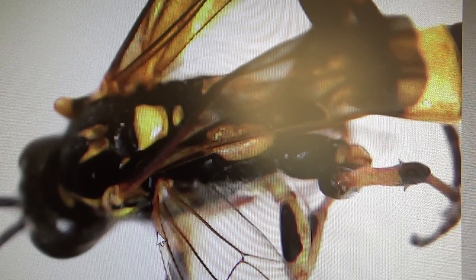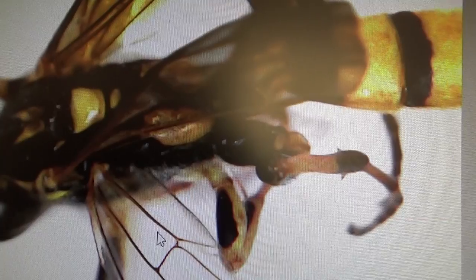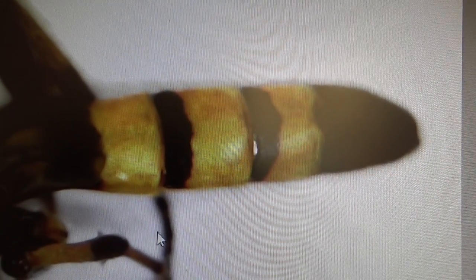Look how you can see the waistline - exactly where his waist is right there. Wow, look at those details. That's the end of them, look at that.